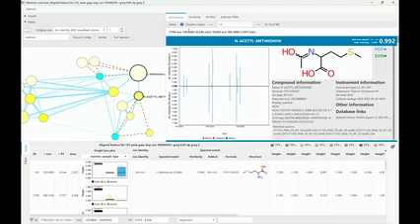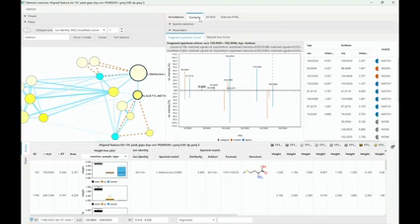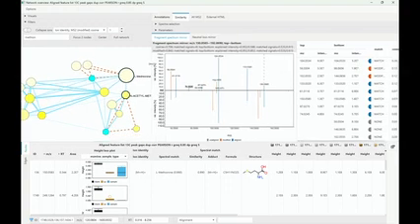two. And I can select them by shift clicking multiple nodes, and then click over to similarity. And in the similarity tab, we see again there's blue signals. They are grouped and they are direct matches. And like Steffen already told you, there could also be neutral loss matches. So we could just lose water, lose the same thing, but then retain the modification of both molecules. And this is the orange signals.